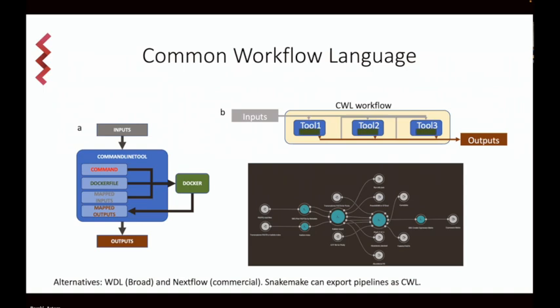And the description includes not just the name, but what the type is, what the meaning of this is, and so on. Because we have this very detailed description of the tools, it becomes easy to connect them into workflows. So you connect the output of one tool to the input of the next tool. And this made it much easier to assemble the pipelines. And in fact, there are graphical editors where you can drag and drop tools.